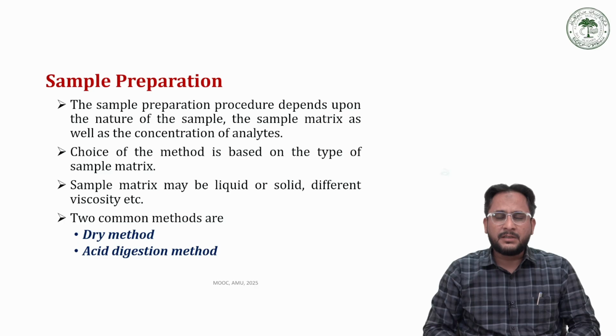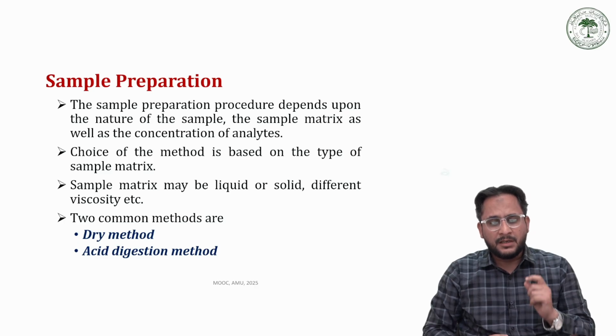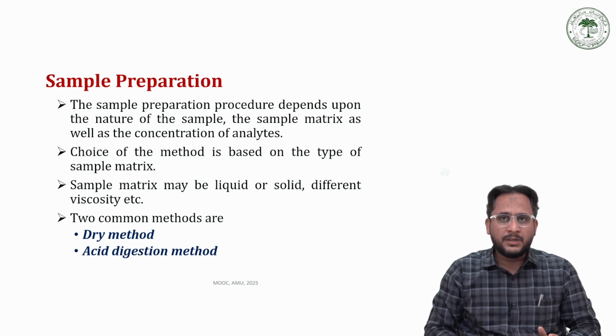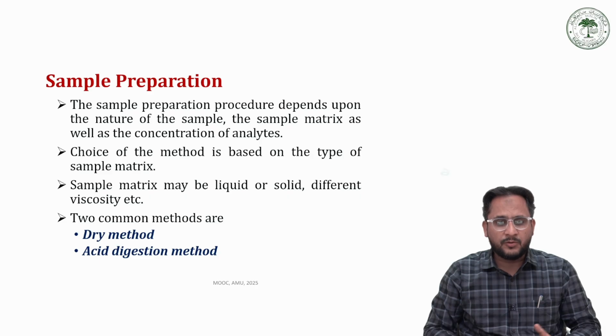Of course, the method of sample preparation has a strong influence on the results of a particular analysis, especially in case of ICP AES. The method which we are going to use has a strong effect on the results, especially in case of atomic emission spectroscopy and ICP. The sample preparation method has a strong influence on the final results.